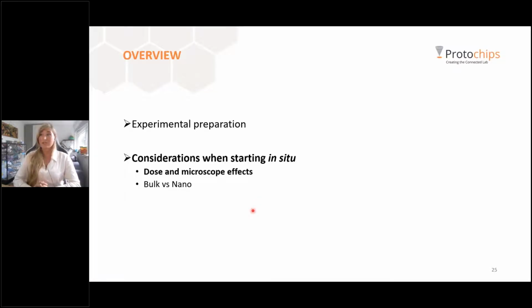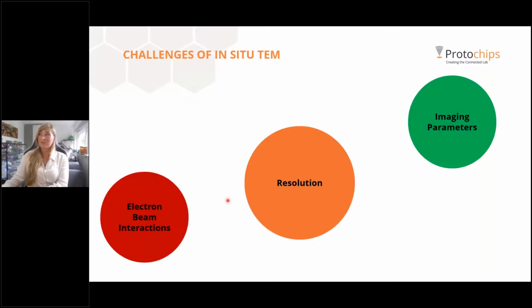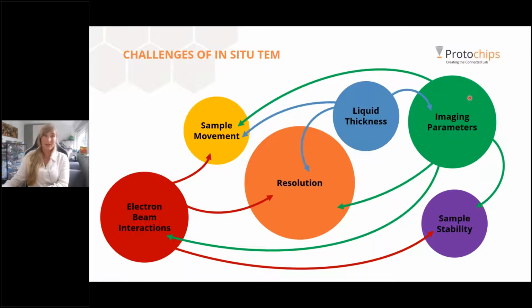So this brings us to the next part about considerations when starting in situ. And as I told you before, one thing that is extremely important is the dose and just general microscope effects. There are so many challenges in situ electron microscopy, and we usually say it's always a trade-off. So everything will be happening at the same time. You can have electron beam interactions that will affect your resolution, sample movement, and sample stability. If you're working with liquid, there's always liquid thickness to take into account, or sample thickness in other types of experiments. And then there's other imaging parameters such as your resolution, your magnification, your apertures, anything that can also affect your resolution, your sample movement, and electron beam interactions and stability.